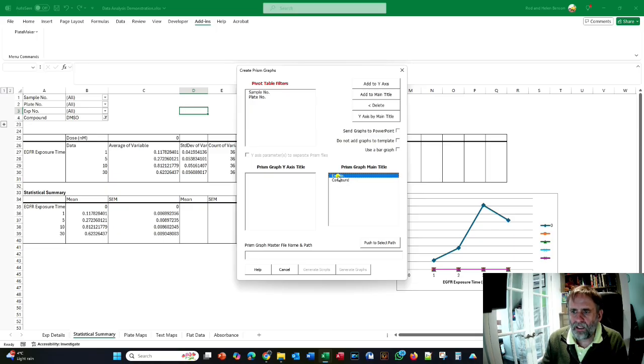So in fact, I'm going to take this one out and re-add it so that it's under the compound, so the compounds are grouped, and then it's experiment 1, 2, 3. If you want to explore what it means to swap those two around, you can do that and see how that works. Okay, so we have no y-axis because we only have a single dependent variable.